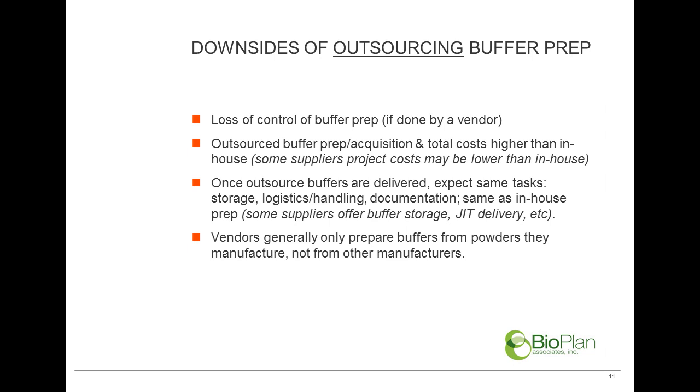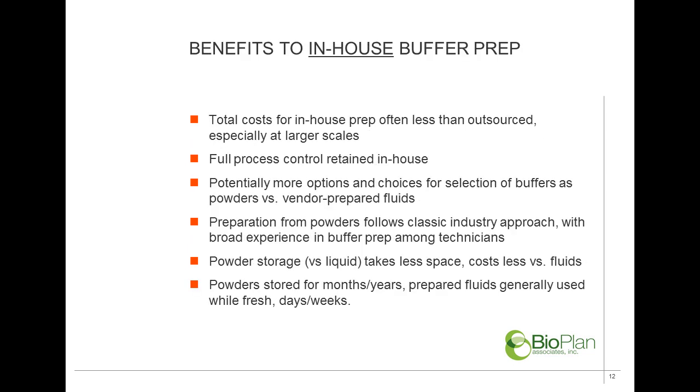Once outsourced buffers are delivered, and this is again a downside, you still have a certain degree of the similar tasks, including the logistics, the handling, cold storage. Some suppliers have, on the other hand, been offering buffer storage and just-in-time inventory. And lastly here, vendors generally only prefer to prepare buffers made from powders that they manufacture, not other manufacturers. Obviously, that's different from supplier to supplier.